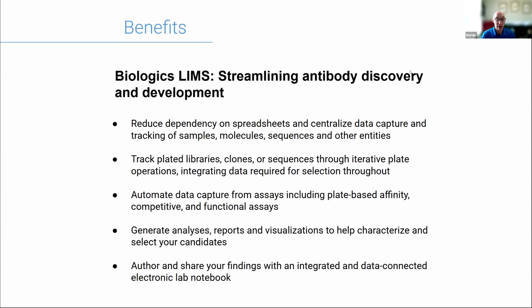We will really benefit your operations by speeding up a lot of what happens. A lot of the data capture and analysis, as you could hopefully see, can be automated. LabQ can simply listen for new data as you produce it, import that data, and form the right association. So you can simply step up, look at your analysis across multiple assay types and things like that, and make decisions about what you want to continue to act on.